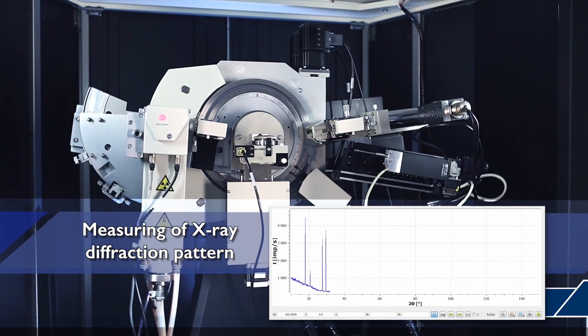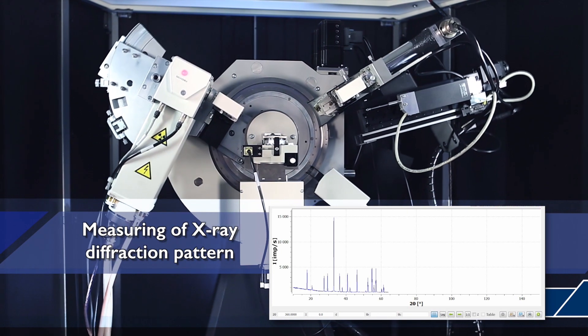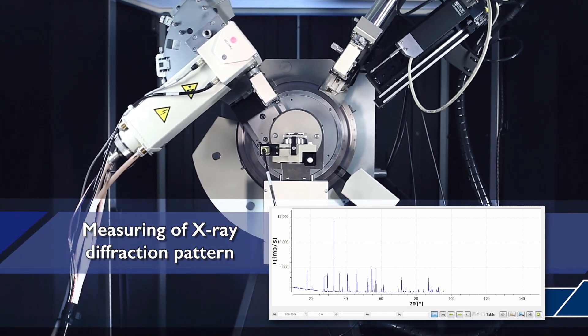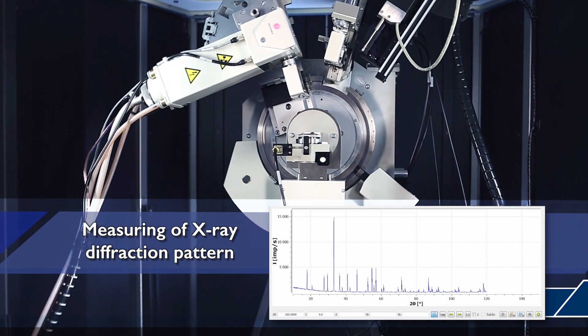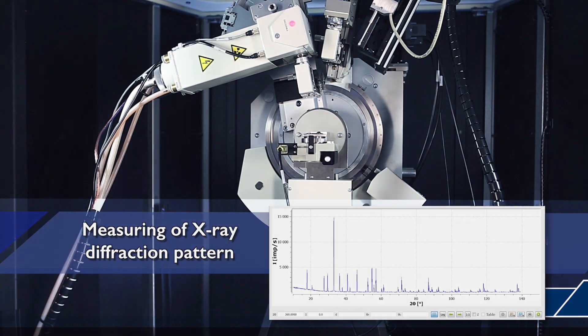Measurements can be done in both discrete and continuous modes at theta-theta scanning rate up to 50 degrees per minute. It facilitates collection of reasonable data in just a few minutes and helps obtaining full powder diffraction pattern suitable for analysis.